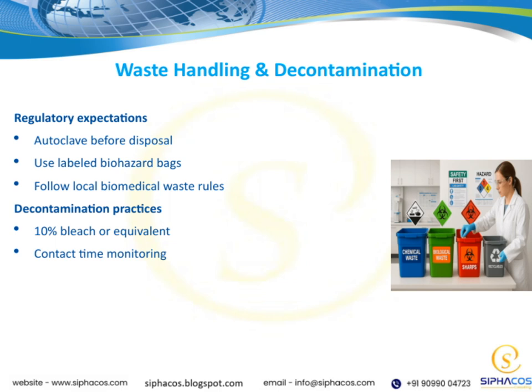When collecting waste, use clearly labeled biohazard bags so everyone can easily identify the contents and handle them accordingly. It's also essential to follow local biomedical waste rules, as regulations can vary depending on your location. These rules guide how waste should be stored, transported, and disposed of safely.